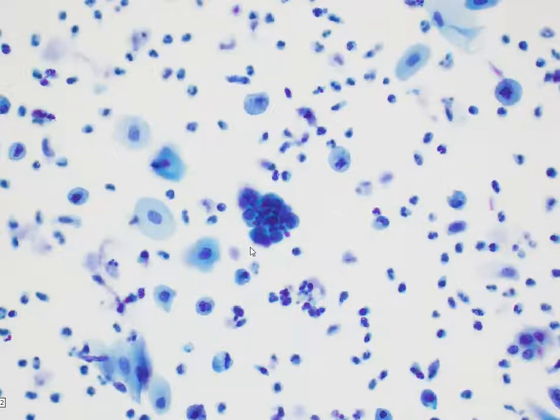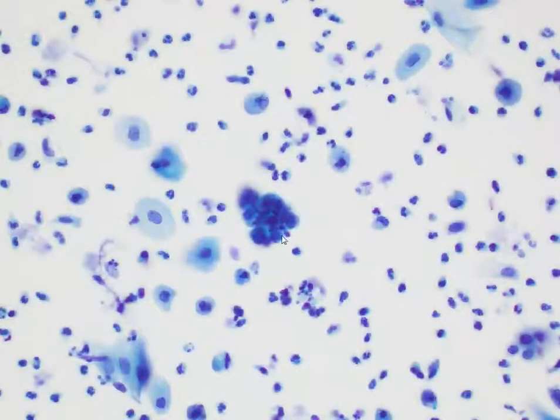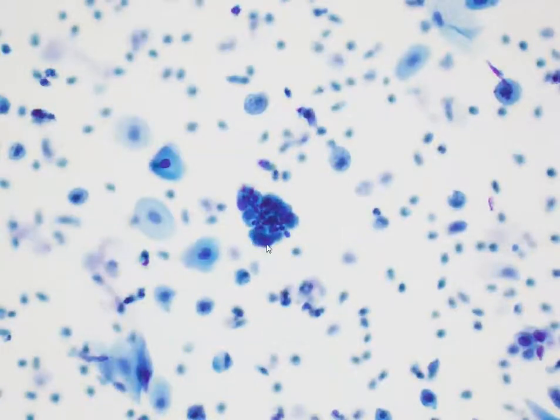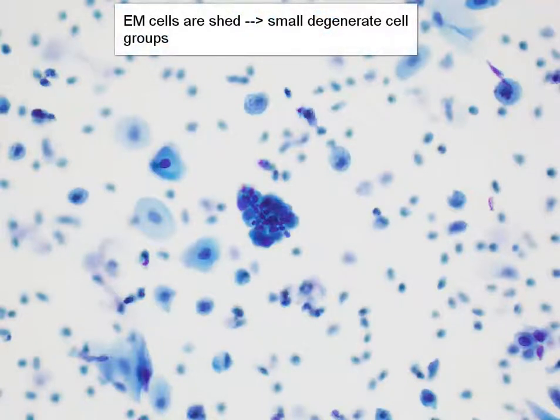Here is a medium power view of a hyperchromatic crowded cell group. This cell group is actually quite small when you compare it to the adjacent squamous cell, and it has a lobulated outline which immediately makes you think of glandular cells. When we see small groups of atypical cells with this appearance, we must always think of endometrial cells, because they tend to shed rather than being scraped off directly. So usually the cell groups are small and fairly degenerate.